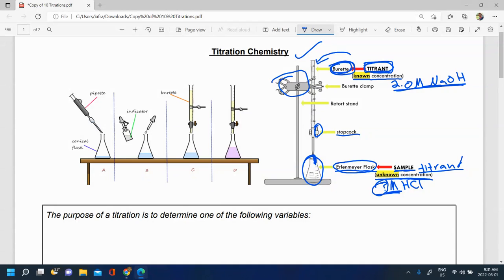The other thing I didn't mention yet, which is important to also mention, is that in addition to putting the substance of unknown concentration in the flask, you need to also put an indicator. Because many of these reactions that we do for titrations in grade 11 and 12 are very boring. They don't have much to indicate that a reaction actually happened because they're acid-base reactions oftentimes. So we add a few drops of indicator to change color to let us know when the reaction is actually completed.